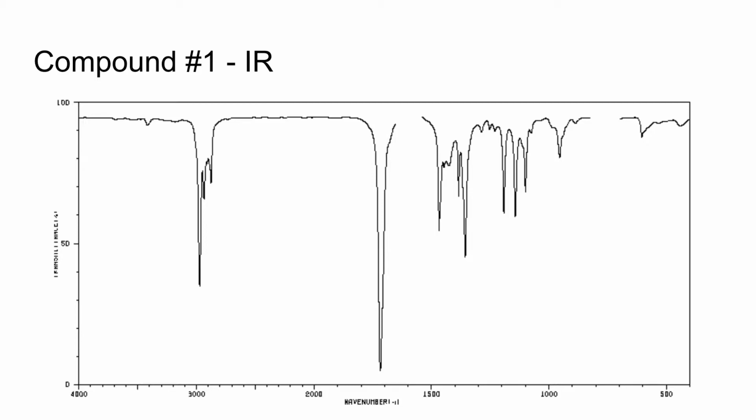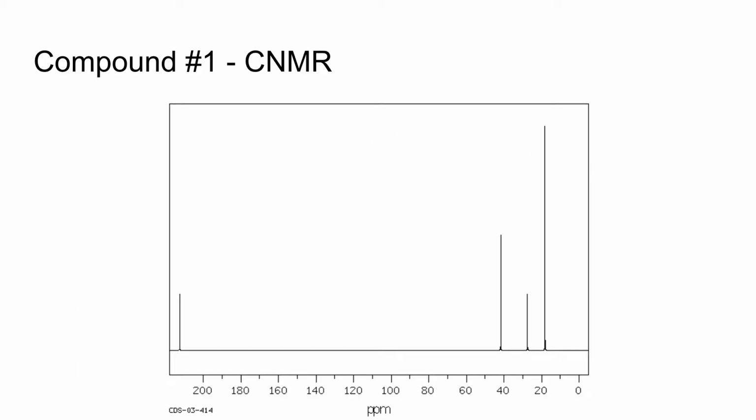I think I was talking over here with Annabelle, and she pointed out that there is no halogen stretch down in the fingerprint region, right? So she was looking really closely. Is there even a chlorine or anything on the molecule? You look down there in that messy fingerprint region. This is actually pretty clean for once in this spectrum. So there's no chlorine or halogen, and that's another thing we can discount. Which means it will be an alkyl group. Okay, let's move on to the CNMR.